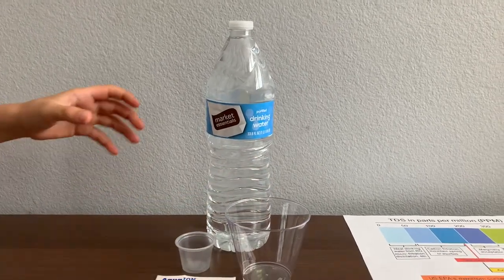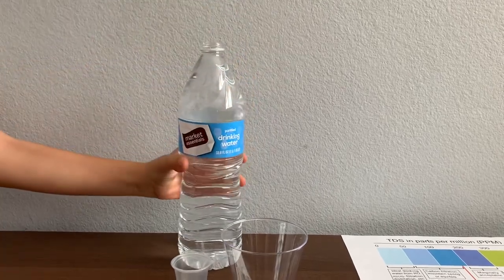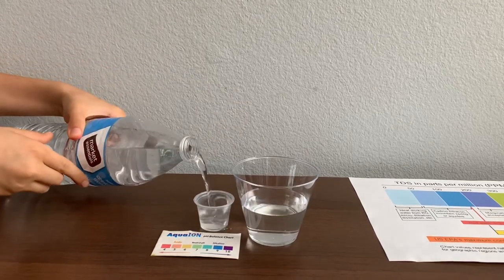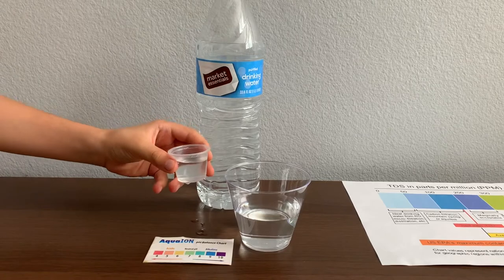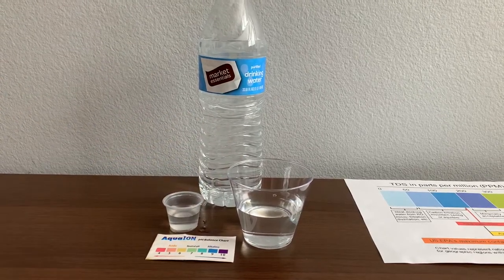Let's test the pH and TDS levels. Let's pour some water in. This is a little too much for the pH cup, so let's pour some back into the TDS.